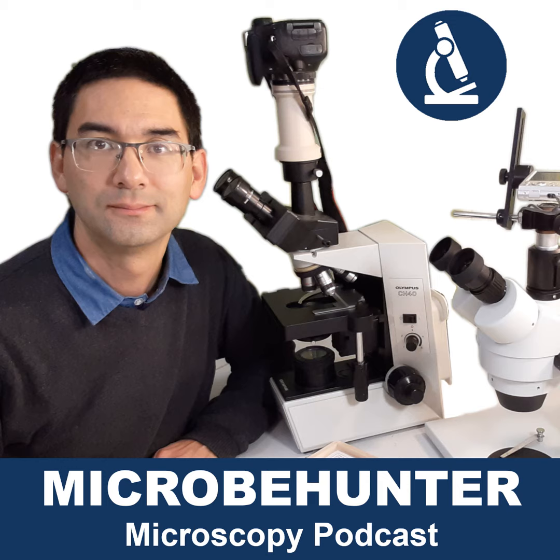If you want a little more, 600 times total magnification is even a little bit better. It's a little bit more difficult to use under certain circumstances, because the distance between the objective and the cover glass of the slide is very, very small. So mechanically it's a little bit delicate in that sense, but generally you're covered.